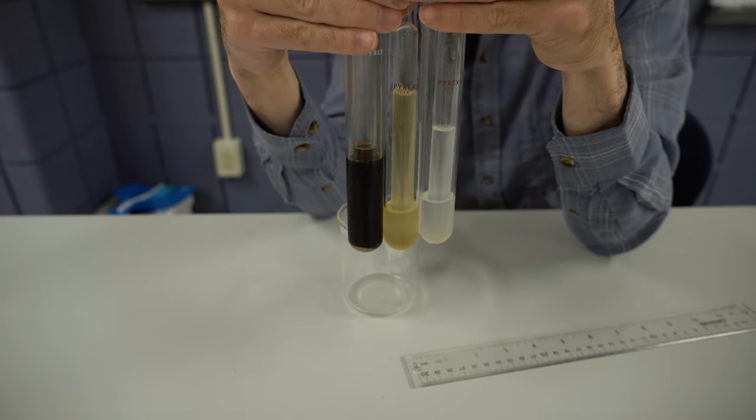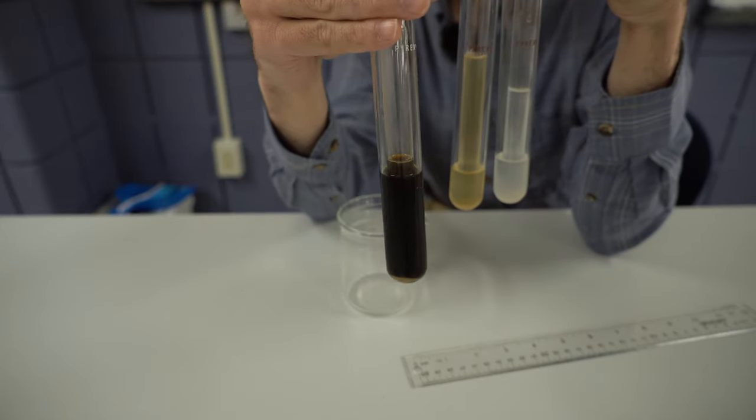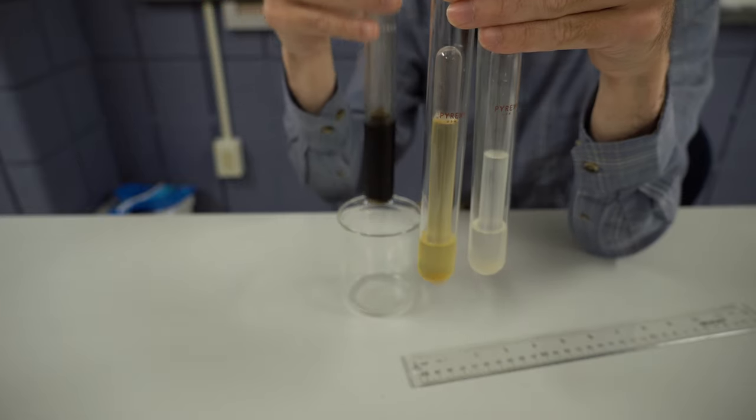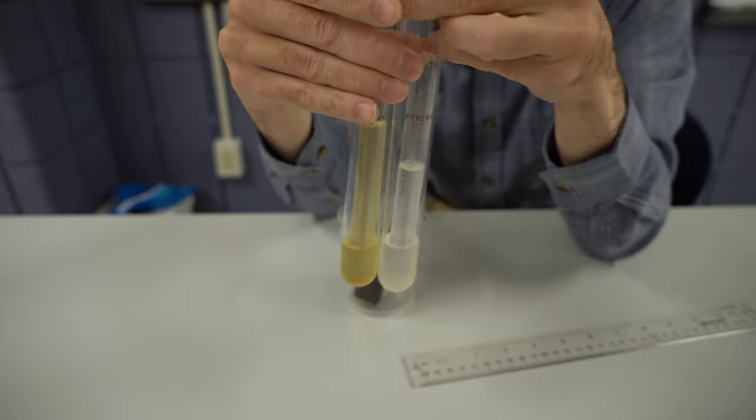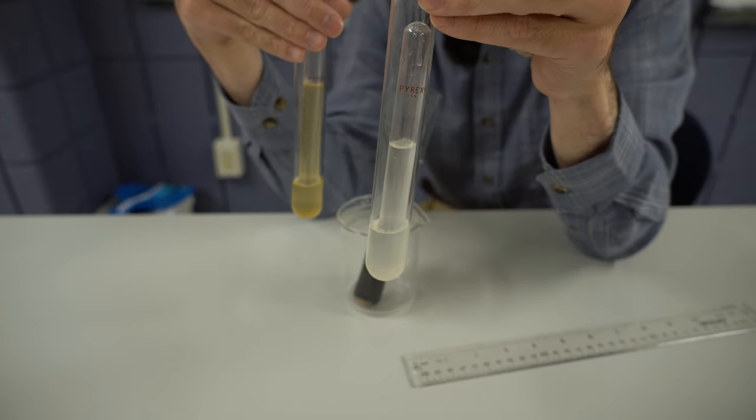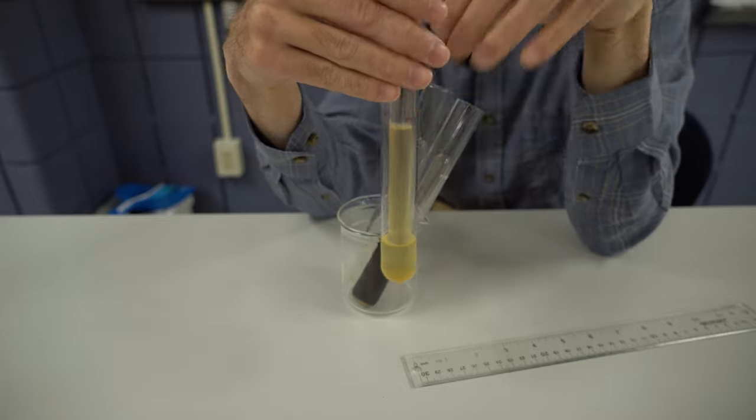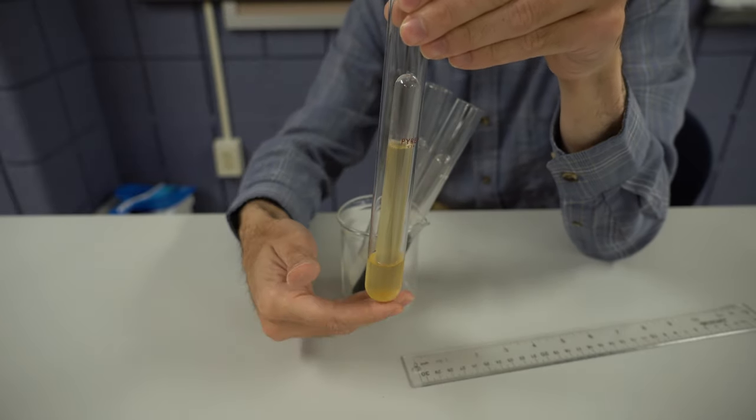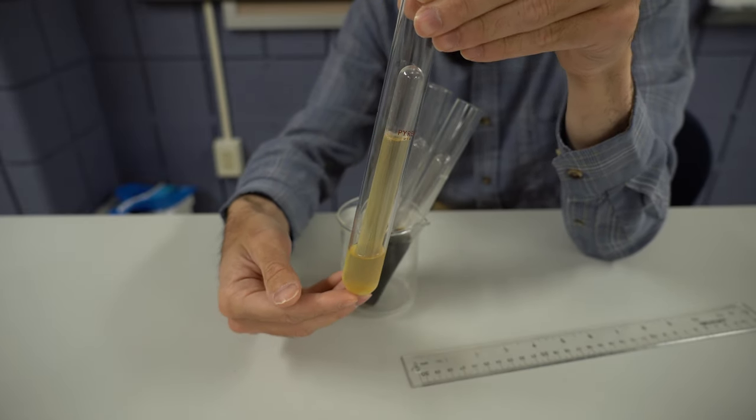The greater the bubble height, the greater the amount of yeast. So in our example here, the molasses definitely has the greatest bubble, indicating that the yeast is growing the best in this sugar solution. That would then be followed by our sucrose, our refined sugar, located right here. And lastly, it looks like in this example here, the honey had the least amount of yeast growth relating directly to the least amount of carbon dioxide produced.